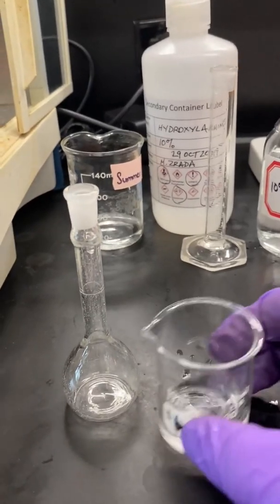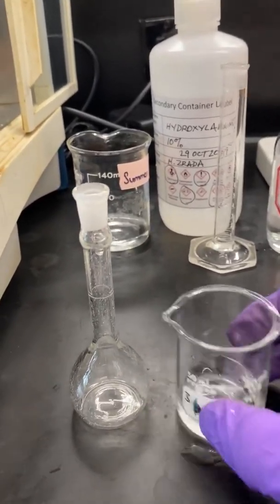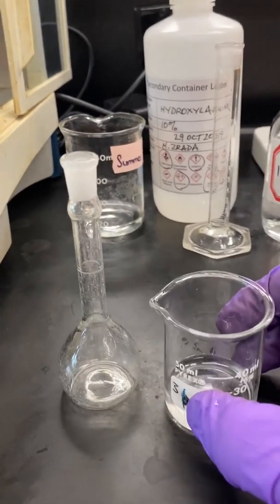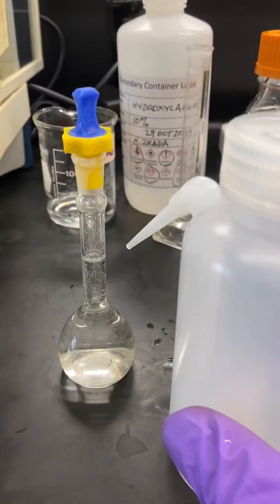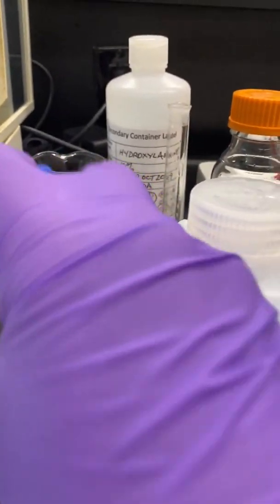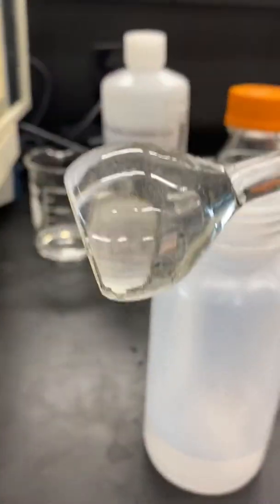Dissolve the iron unknown in a small beaker using some distilled water and transfer it to a 25-milliliter volumetric flask. Fill the flask to the mark with distilled water, cap it, and mix it well. This is Stock 3.